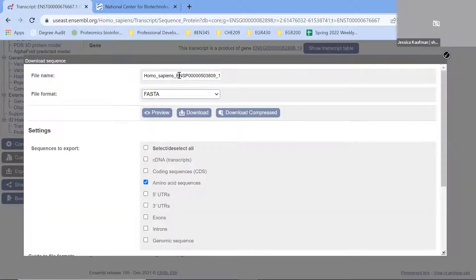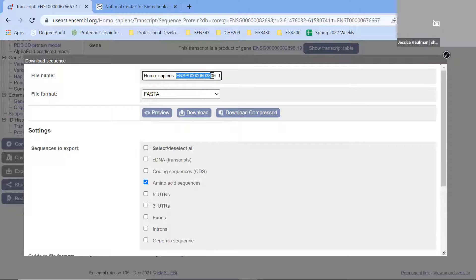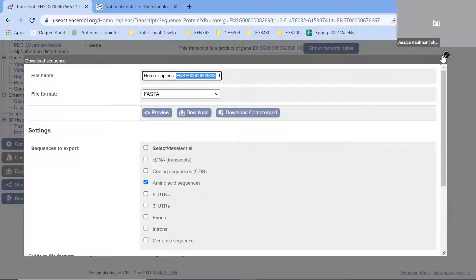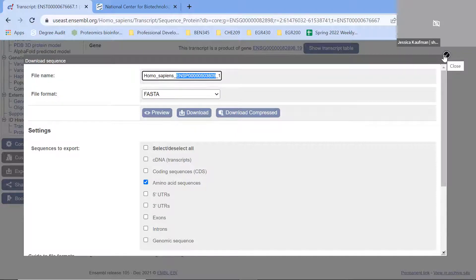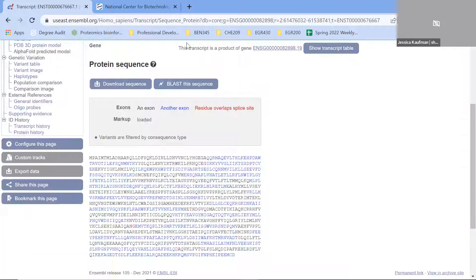When I go to download as a FASTA file, one of the things that comes up in the file name is the protein code. Once I download it, that will answer the first couple questions - what is the protein associated with the transcript and what is the amino acid sequence.